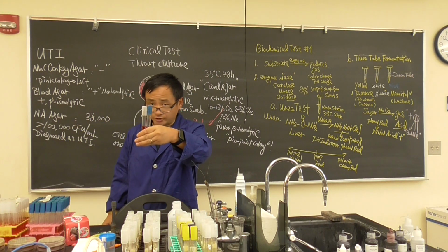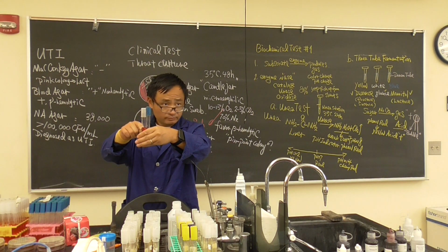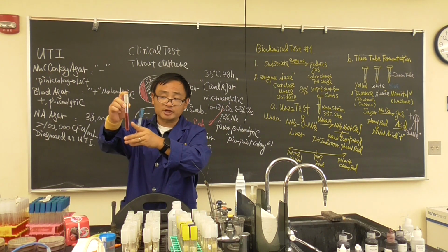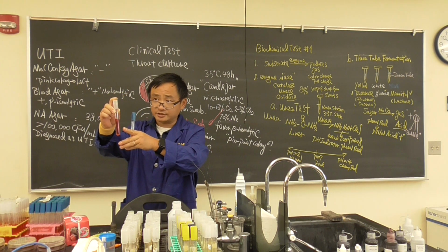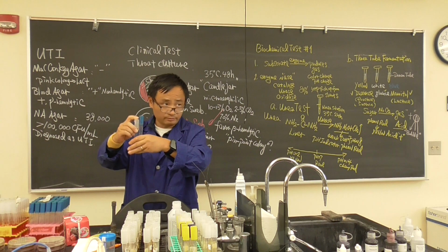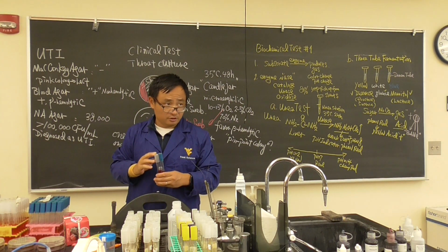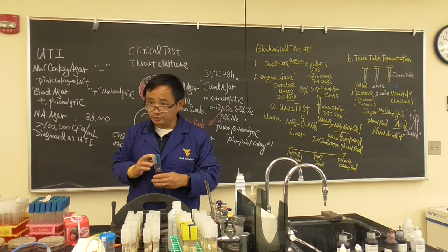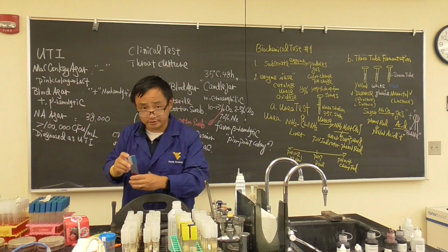Number 1 accident in the lab: the tube. Don't forget, inside is another Durham tube. If this is broken, it's going to be horrible. Glass everywhere. So make sure today only 4 tubes for the biochemistry test. You label them very well. Have your rack ready to get them.